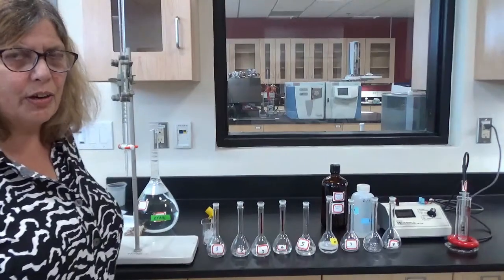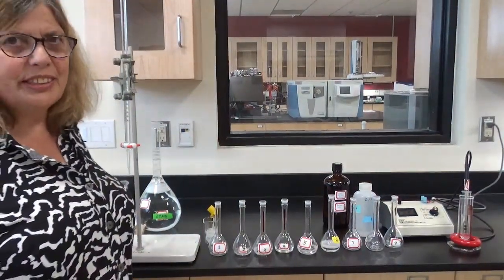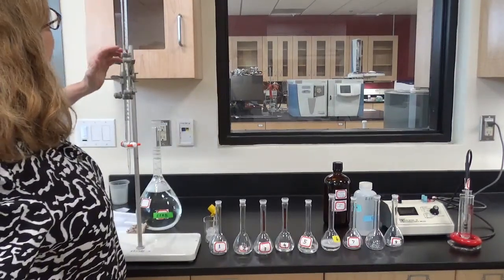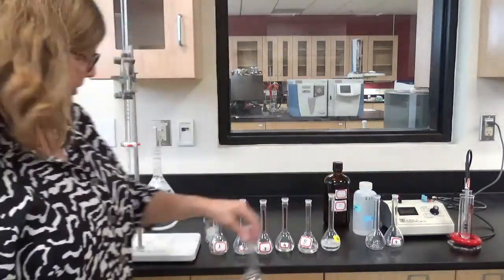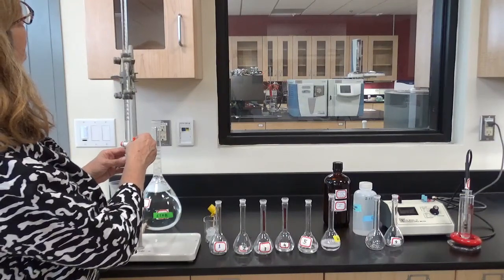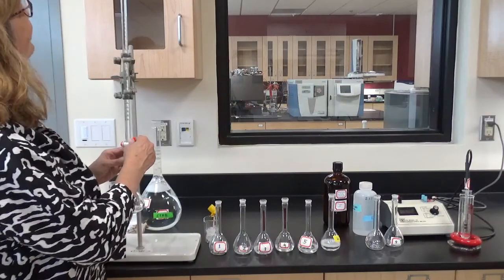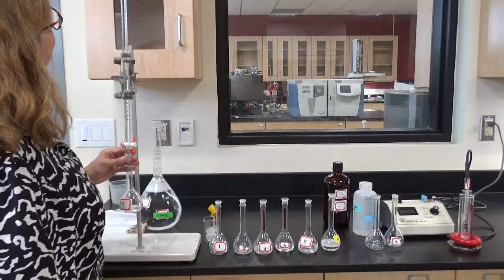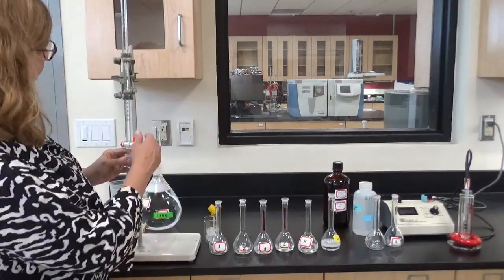So just to let you know, I'm still plodding along at this. I'm going to be making solution 7, and I'm going to be putting 30 mils, so from 0 here to 30 down here. So here's my solution 7. And I've had to refill this burette quite a few times, and I'll have to refill it more. But I thought I would just show you one of these longer ones. I mean, it's really not very exciting, which is why I haven't been showing more of it to you.